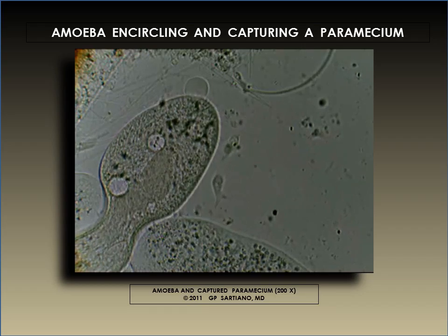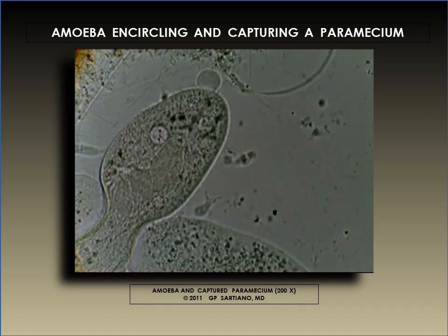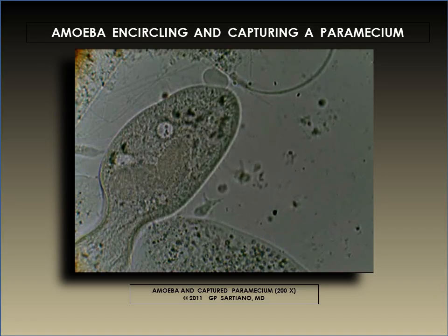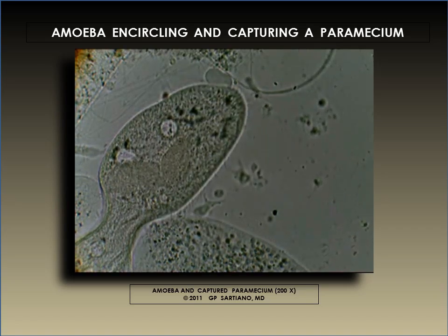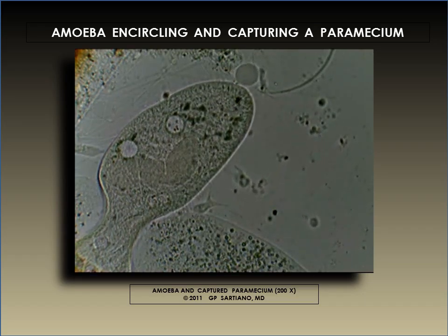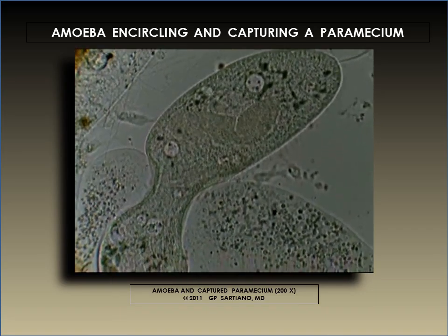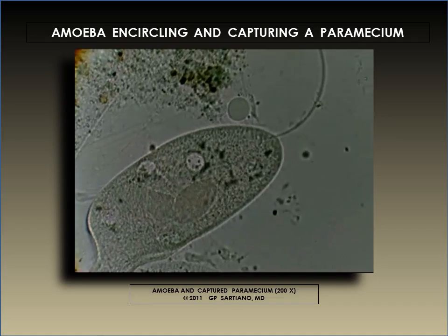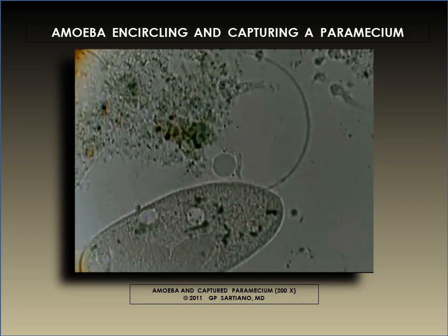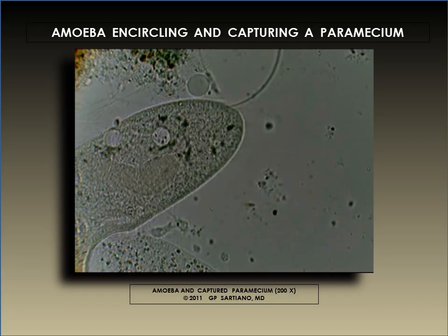Notice again how the flexibility of the paramecium serves its escape. It squeezes through a space smaller than its own width. This is not to say that it has not been damaged. Its reconstituted self, seen re-establishing its form outside the amoeba's circle, is distorted and almost unrecognizable as a paramecium.